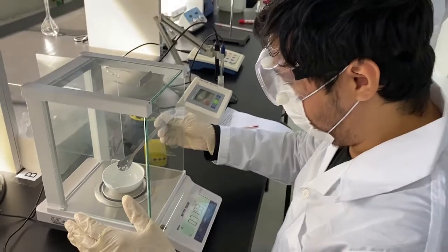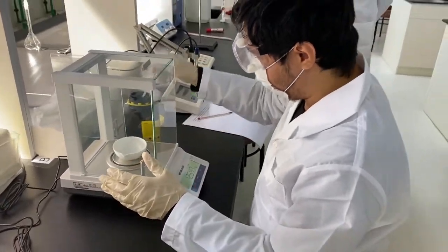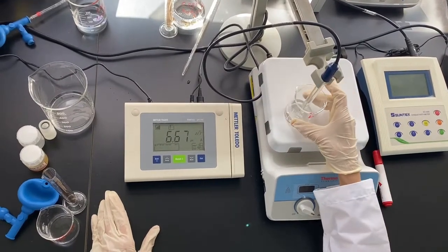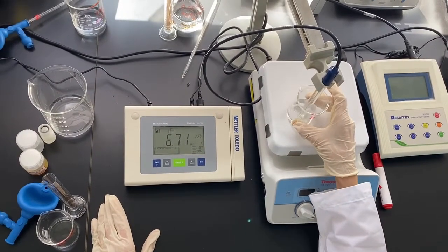It is a facility available for student use to learn basic concepts of chemistry from different experiences such as calibrations, component extraction, qualitative analysis, and others.